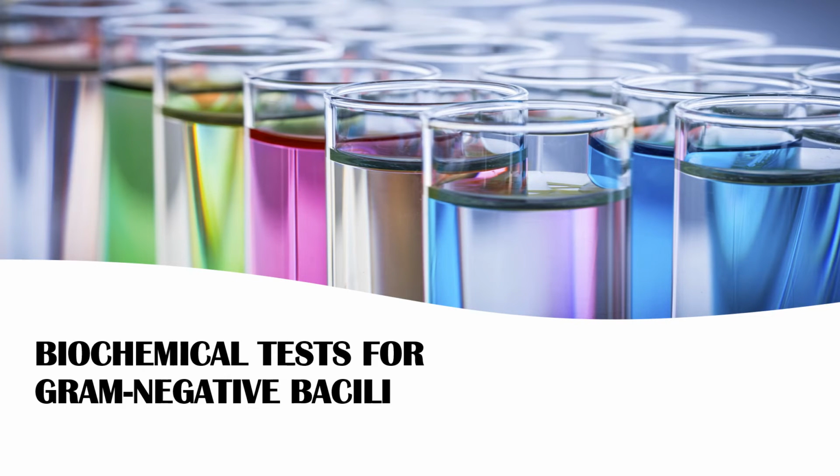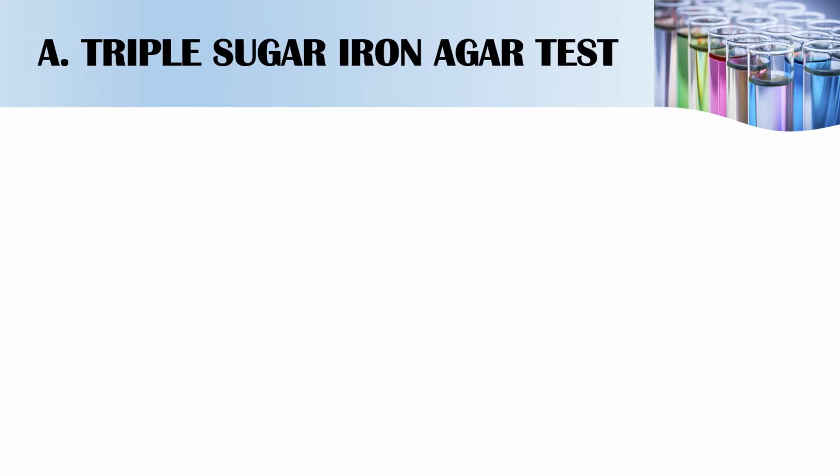Biochemical test for gram-negative bacilli. In this video, we are going to discuss the principles behind the biochemical tests used for the identification of gram-negative bacilli. First, we have the triple sugar iron agar test, or TSI.